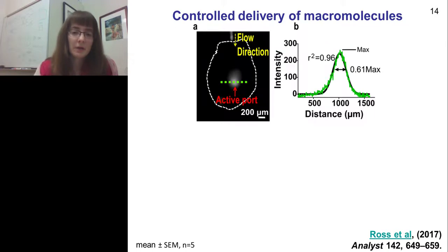And you'll notice there in panel D, for the shortest pulse times, a few seconds, we can get resolution on the order of a couple hundreds of microns, depending on the size of the molecule. And so for these protein-sized molecules, we tend to have 200 or 300 micron resolution, and that's sufficient to target substructures of tissue, such as in the lymph nodes, say a B cell follicle or the T cell zone, or in the brain, you might be targeting part of a cortex, for example.